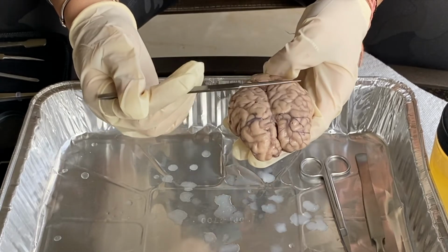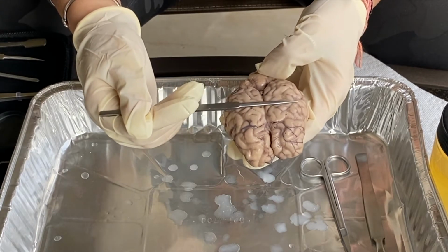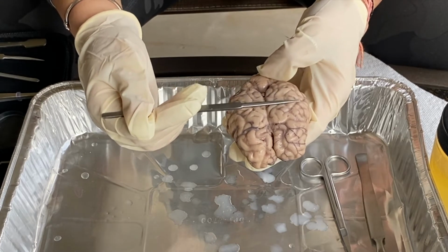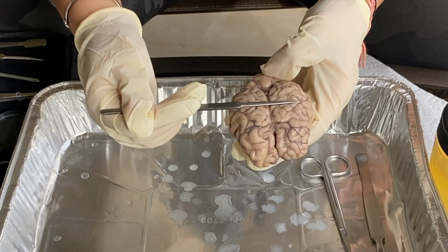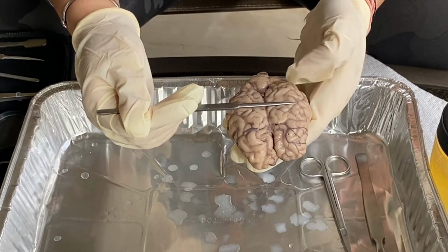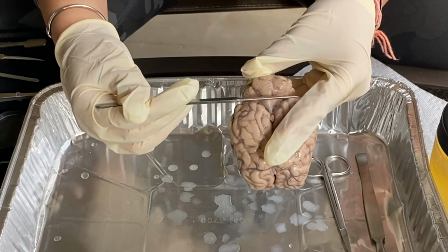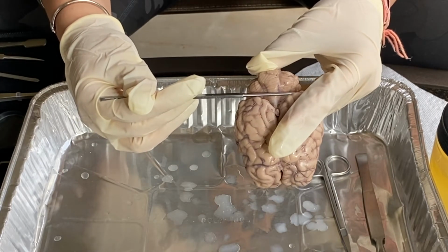Your parietal lobe has functions in sensation and perception, so integrating your sensory input within the visual system, and it has the primary somatosensory cortex.